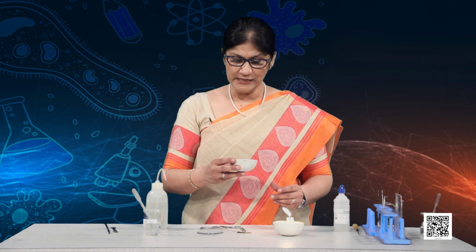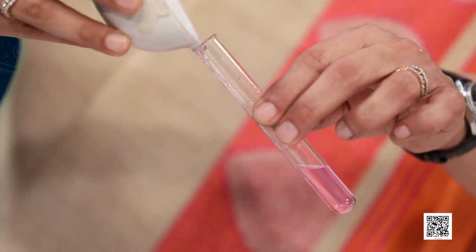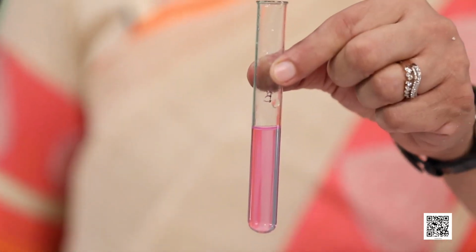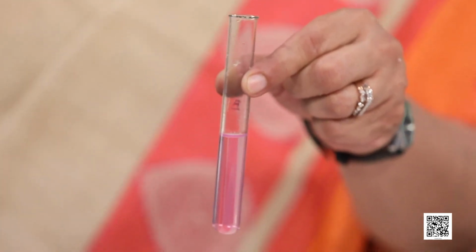I will transfer this to a test tube so that you can see the experiment easily. Okay. So, we will transfer this into the test tube. Yes. Now, you can see this pink colored solution, which is due to the reaction between the metallic oxide, that is magnesium oxide, and phenolphthalein, the indicator. So, beautiful light pink color.